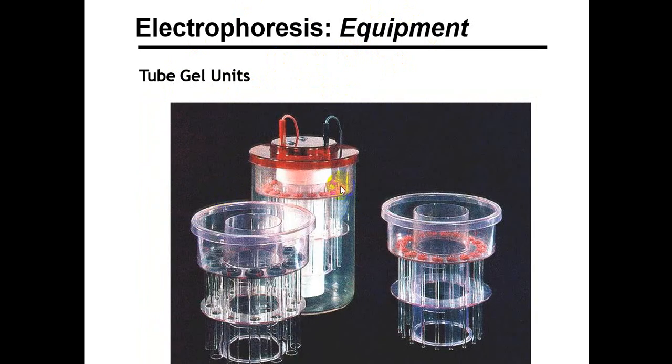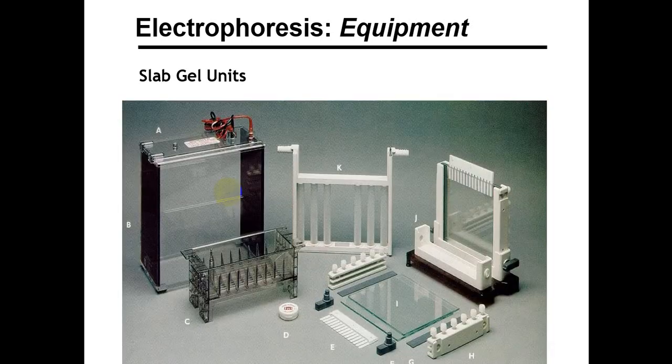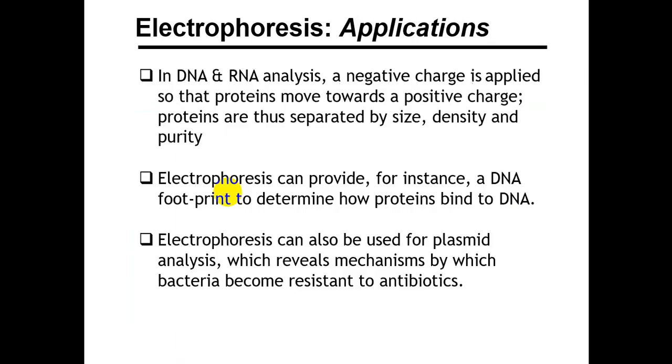So you can have a gel tube where you put the gel inside, or a slab where you put the gel. So polyacrylamide gel will be standing like this inside. Then agar gel, because it's organic and it's not strong, this slab will lie down. Then the gel will flow horizontally. Whereas polyacrylamide gel, the slab will stand like this as it is, and the gel will be inside because it's very robust and synthetic. So these are different types of gel slabs.